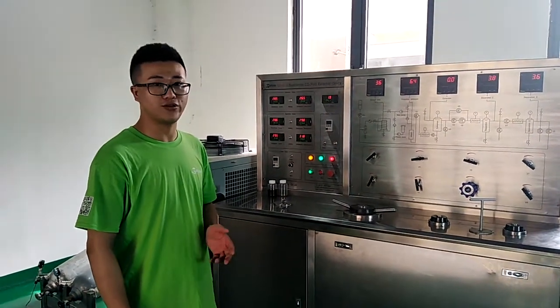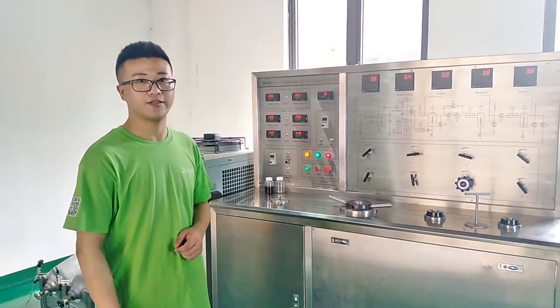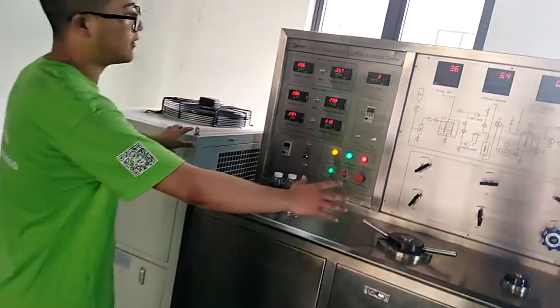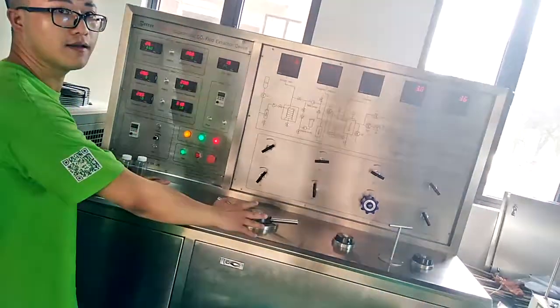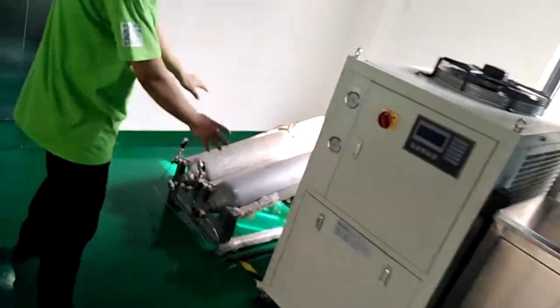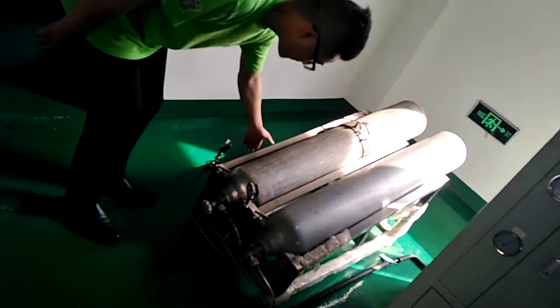It's mainly used to process hemp and cannabis, especially in the US market. Here is the machine. You can see the main body, a chiller cooling system, CO2 bottles for the CO2 source, and the frame.